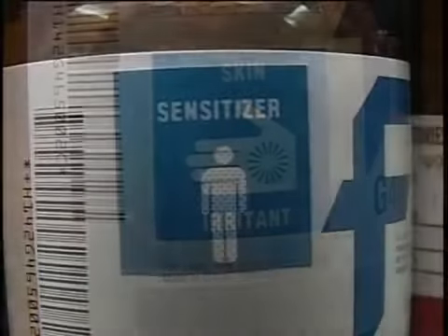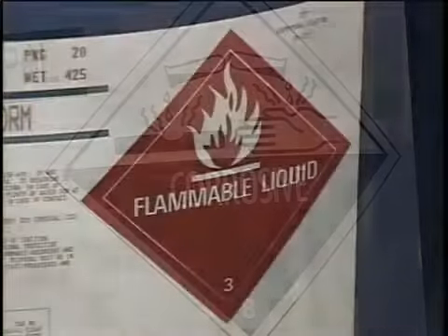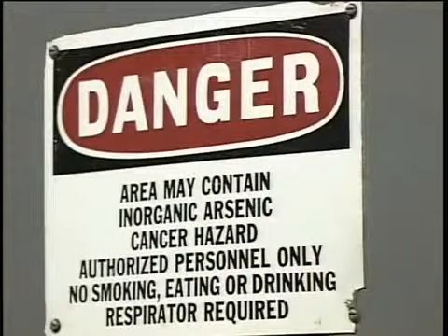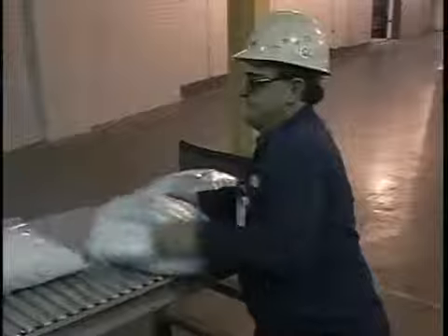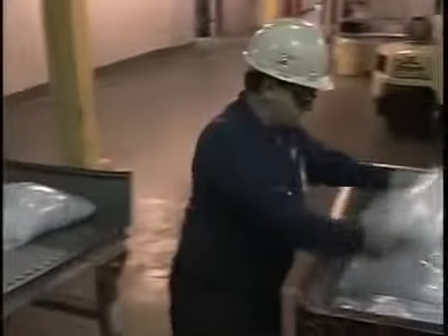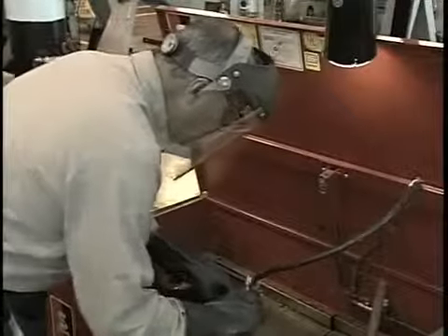Irritants, sensitizers, corrosives, flammables, poisons, carcinogens. Like it or not, hazardous chemicals are a part of our lives. Many of us work around them every day. So we take precautions. We wear personal protective equipment and use safe work practices.